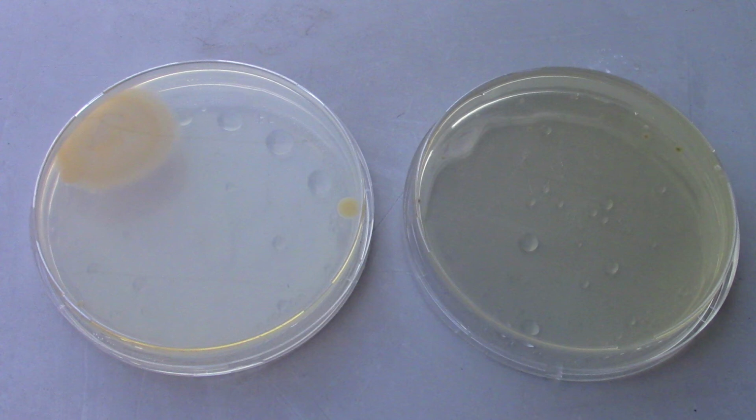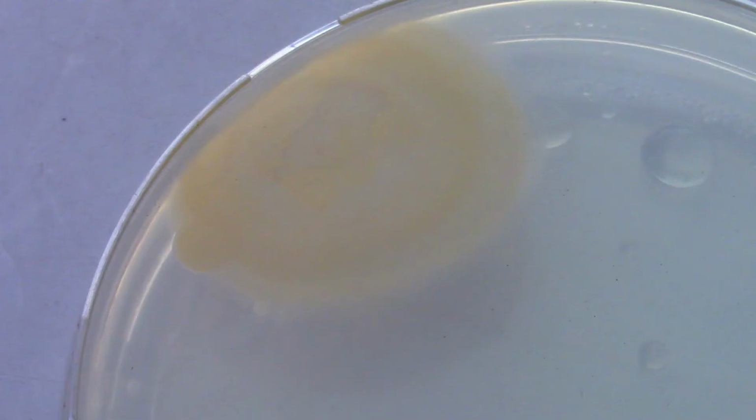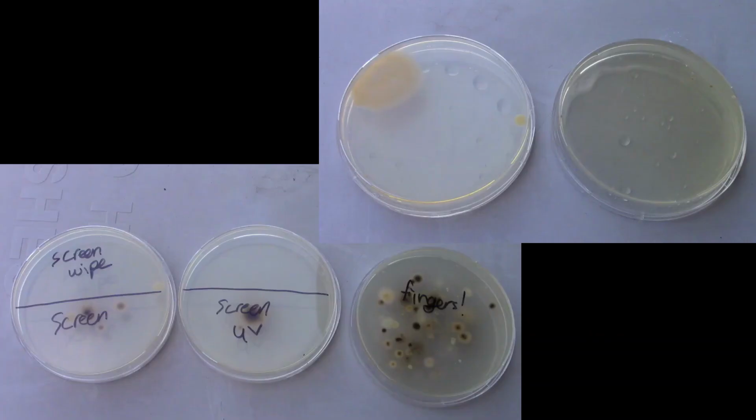So they might have just been air contaminants. In the one, it's barely got these tiny little growths, and then the other, it's got that big yeasty looking one. So that was an interesting control on its own. It was not in the same environment. It was left outside in a decent summer heat. Not enough to necessarily kill off everything, but not in a controlled spot in a warm closet.